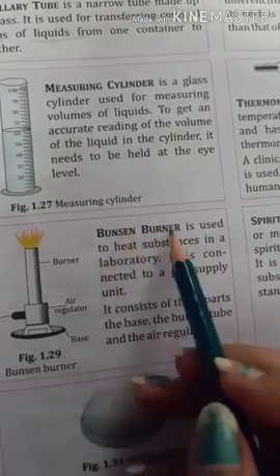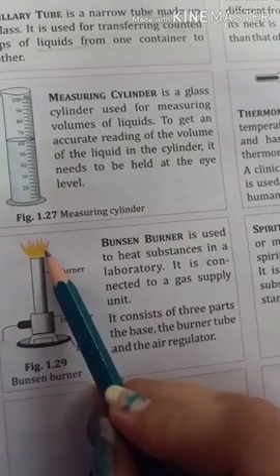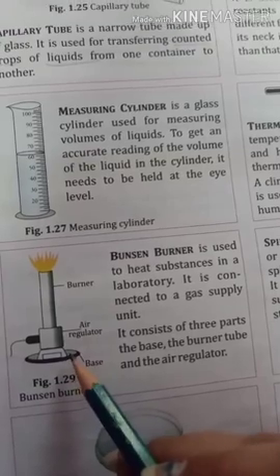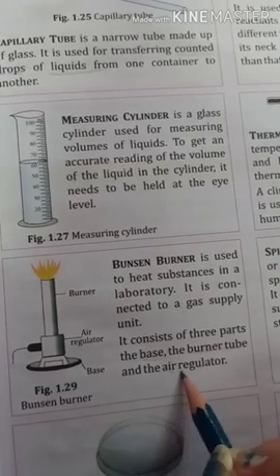Next is the Bunsen burner. A Bunsen burner is used to heat different substances in a chemistry laboratory, and it is connected to a gas supply. So it mainly consists of three parts: the base, the burner tube, and the air regulator.